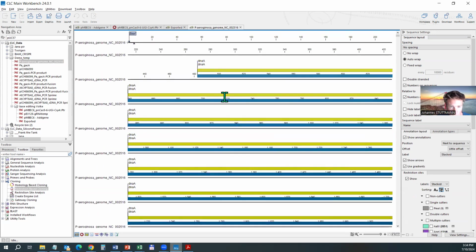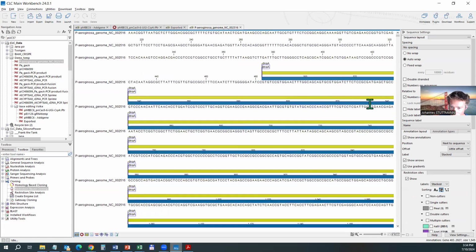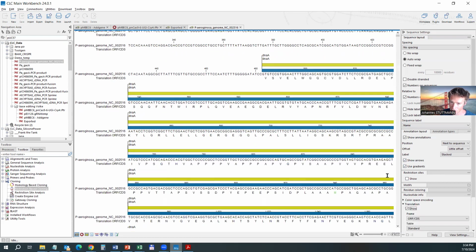So if you think back to what we discussed about base editing and about Cas9, we need a codon that can be edited, and it needs to be at the right distance to a PAM sequence to finally fall within the editing window. Of course, doing this manually is a bit annoying.